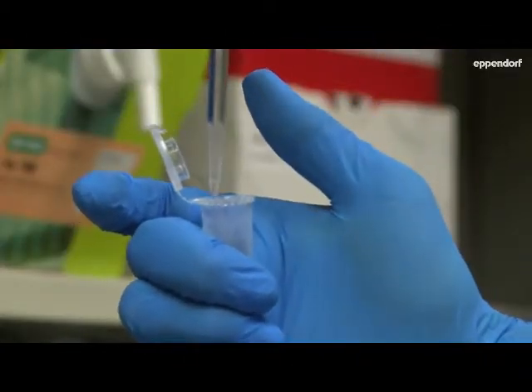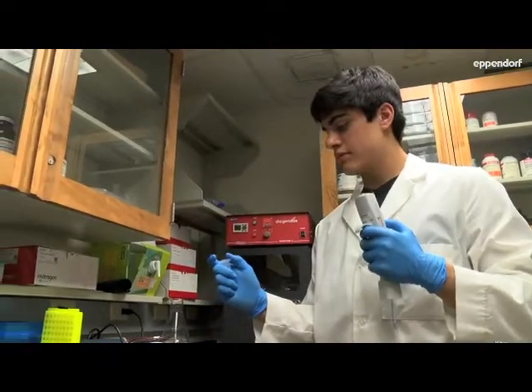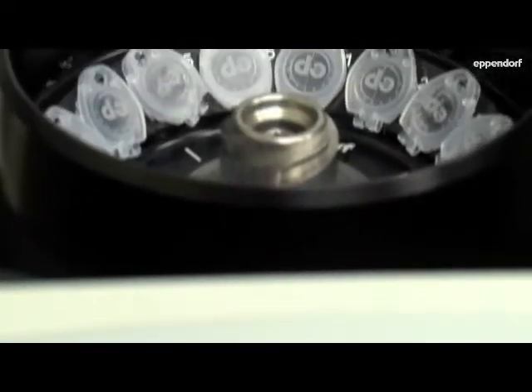We've had great luck with this new five mil tube. It's really done everything that we've needed it to do — as far as being able to seal, as far as having the accessories that we've needed, and everything being really consistent.